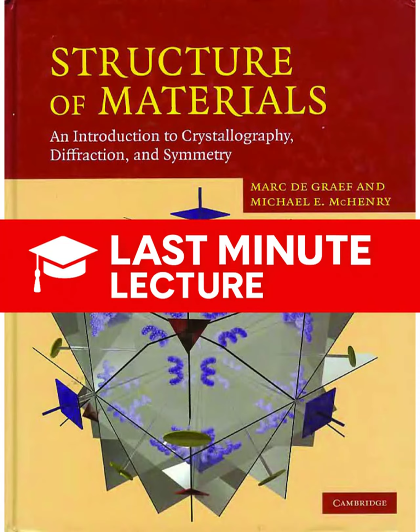So how do we visualize this in terms of the Ewald sphere? The Ewald sphere suddenly gains depth. Since we have a range of wavelengths, we have a range of radii, 1 over lambda. The sphere is no longer a single surface, but a volume contained between two concentric spheres. So it's a shell, not a sphere anymore.